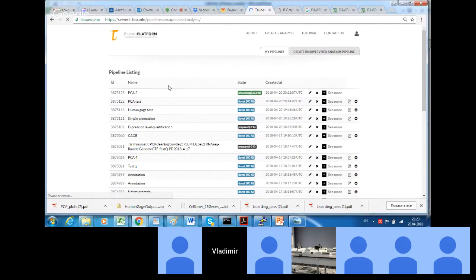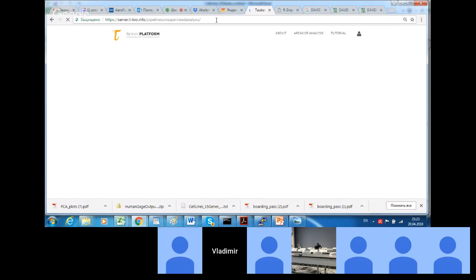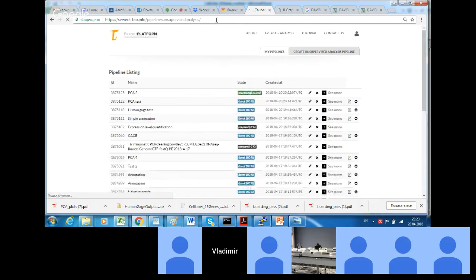So this pipeline is also relatively fast. Let's just wait for a minute and we'll have the result of this pipeline available for my version and hopefully for the ones you're also starting. It indeed does not take long.